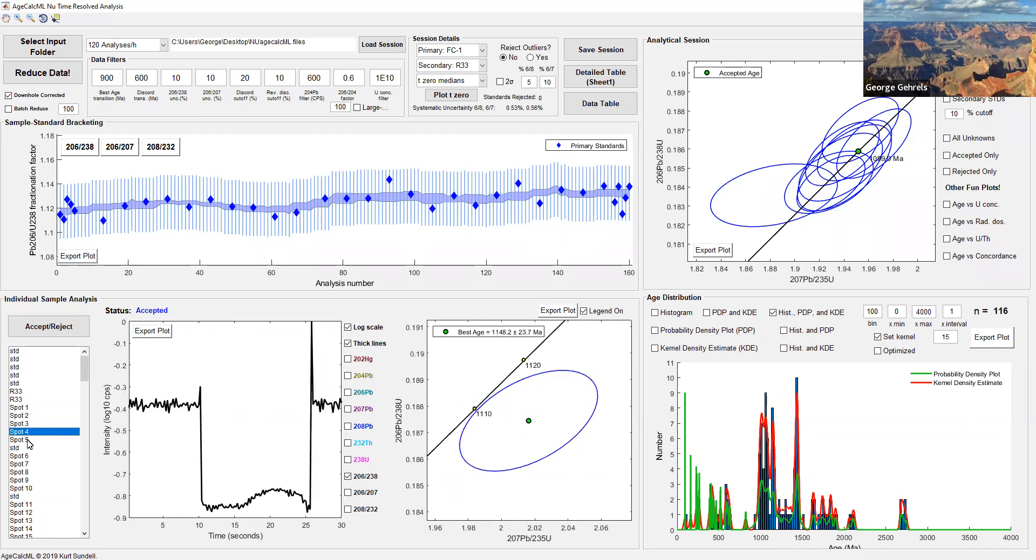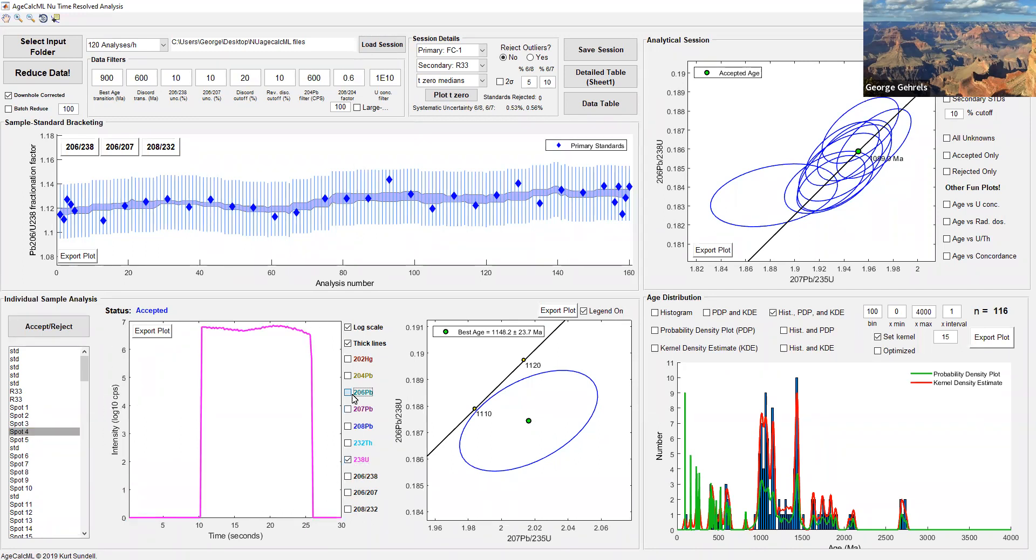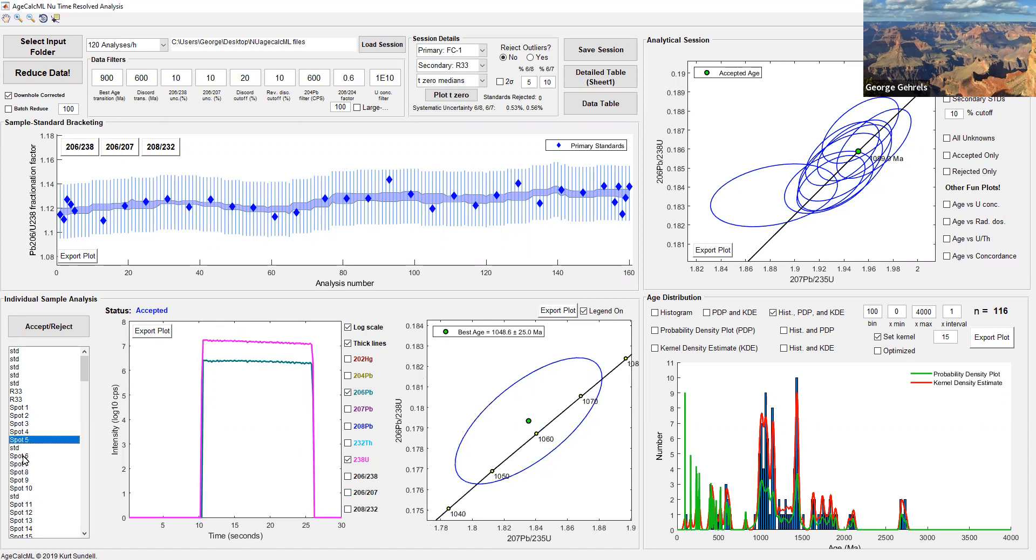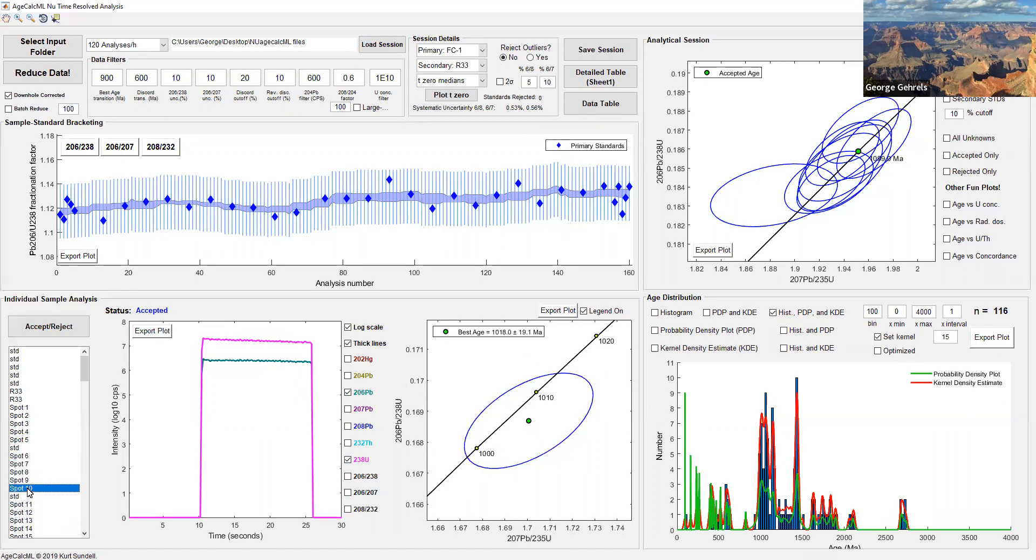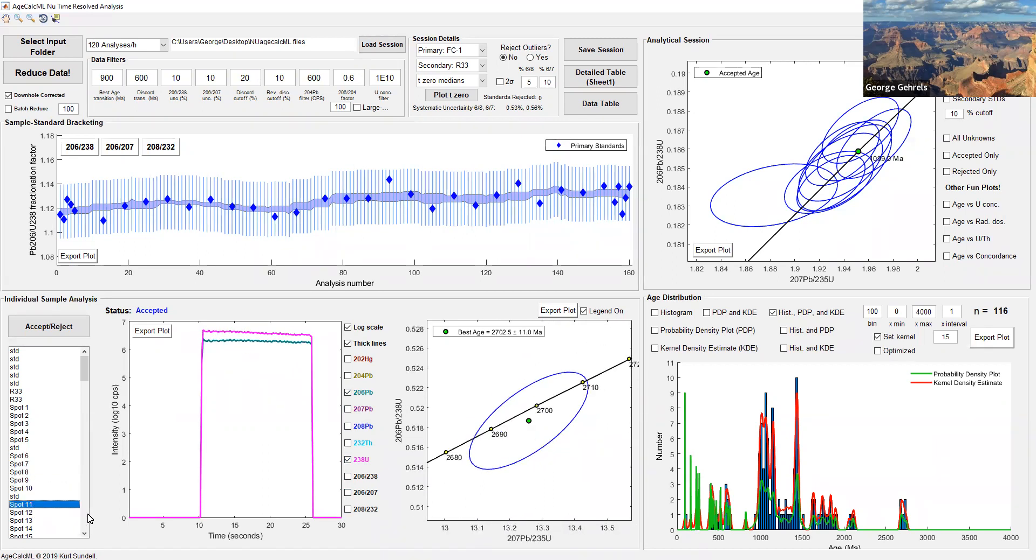This plot in the lower left allows you to go through and look at the analyses for every one of your unknowns. You're looking for weird patterns like something like this, perhaps. This is a good one to show the power of multi-collection. Remember, if we have 206 and 238 coming out at the same time from our ablation pit, being measured in the collectors at the same time, it doesn't really matter if there's some instability in that signal because 206 and 238 are going up and down together. This shows really well the power of a multi-collector ICPMS.